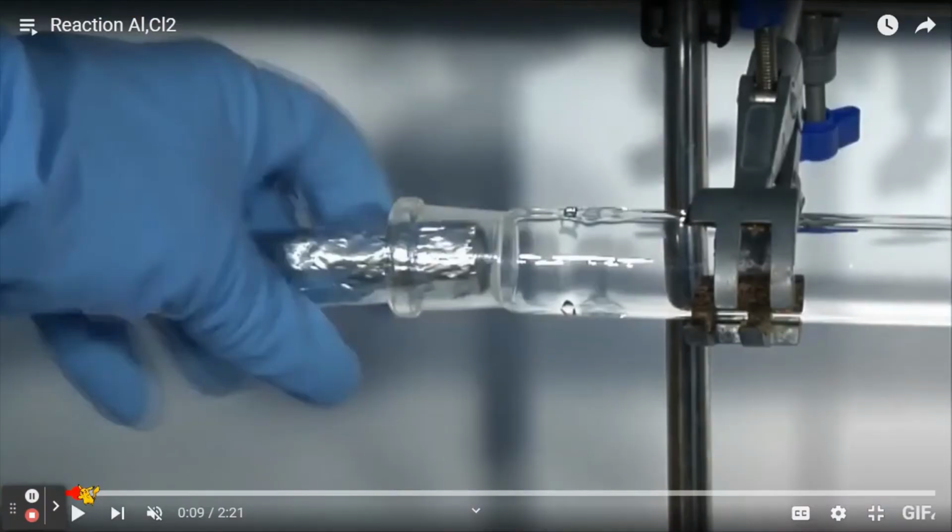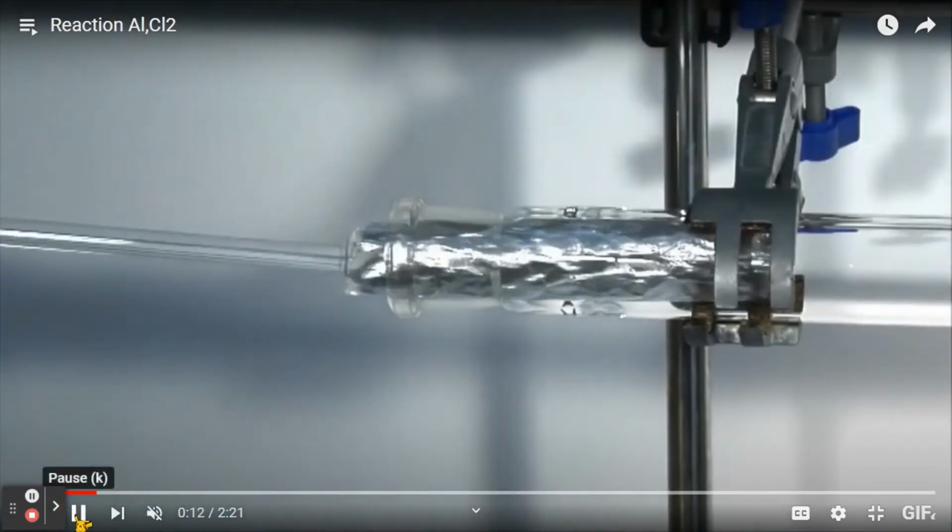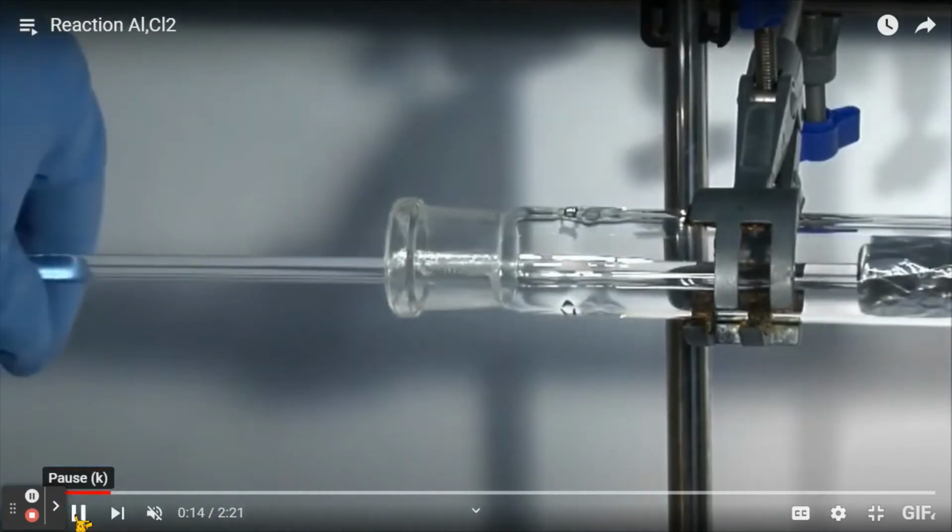I'm going to have a link to their video so you can actually see everything all the way through. But be warned, if you are a GCSE student, I would suggest that maybe the commentary is slightly higher level than GCSE would expect. So what they do is they actually put the aluminium into the glass tube. So there's your glass tube.